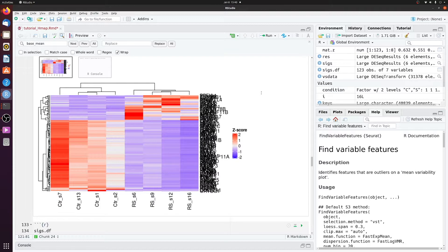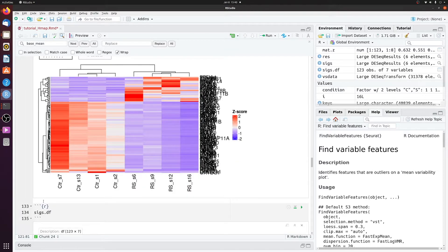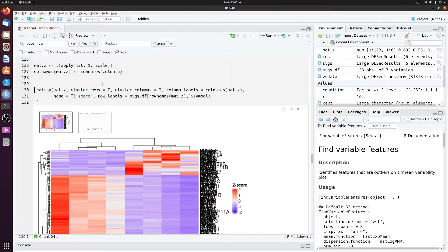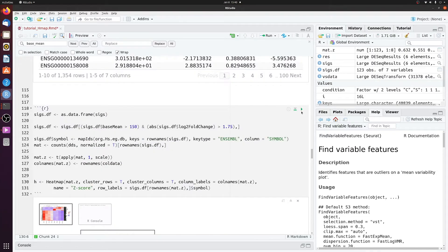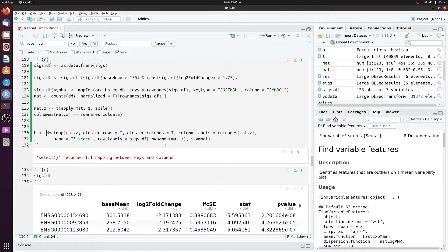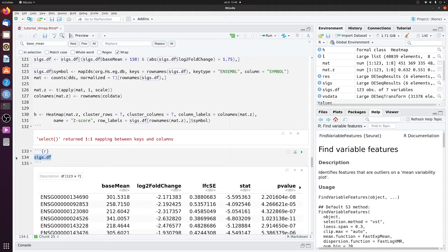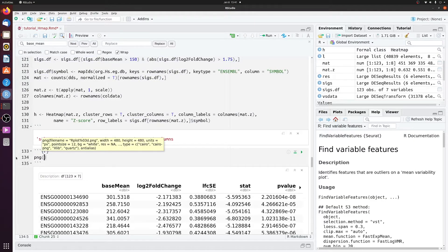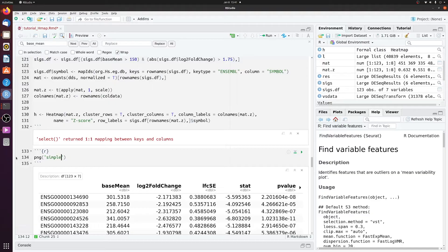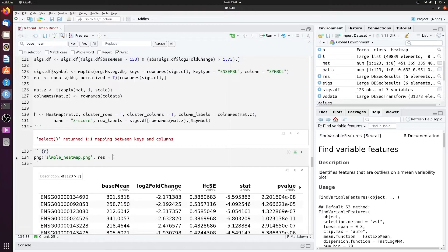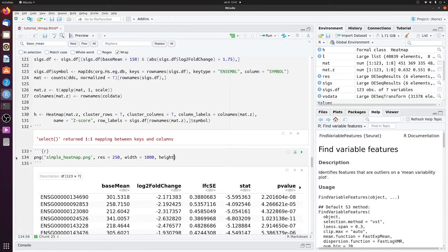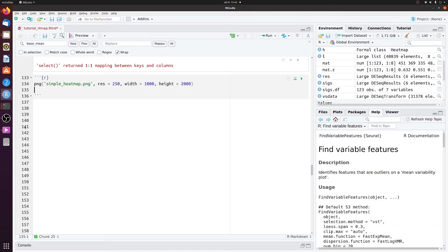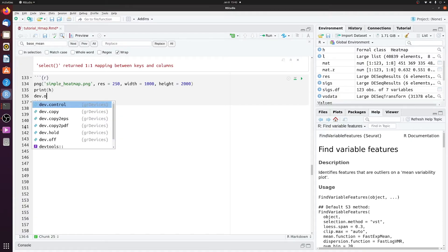And your figure is never going to look as good in RStudio. So let's just try saving it. We're going to set this as h. And then use the png function to save it. The resolution, and then the width, just set it at 1,000. And then the height, just set it at 2,000 and see how that looks. And then we have to save print h, and then dev off.